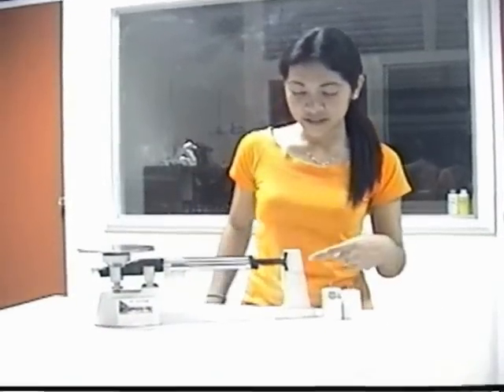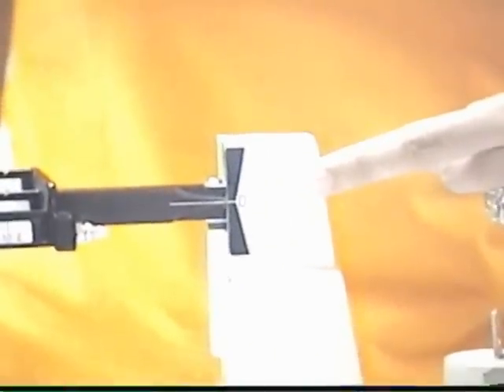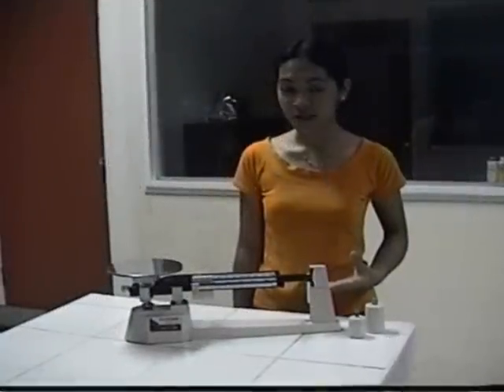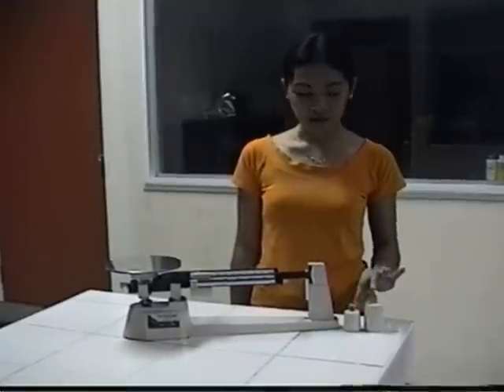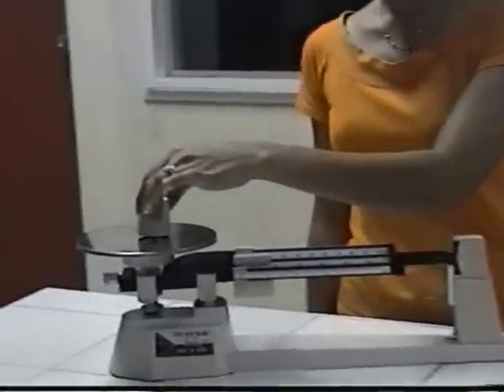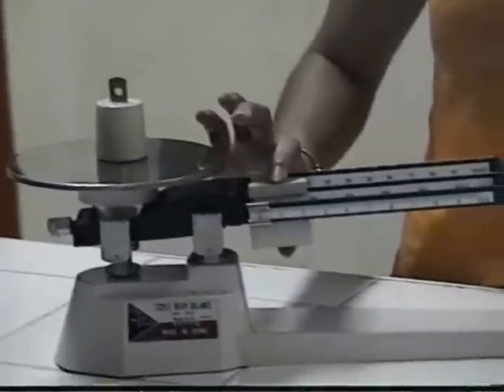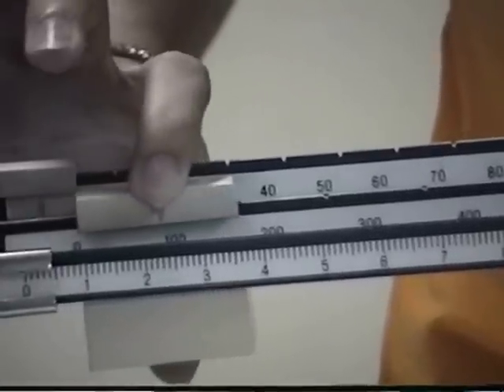By using the Balance, here is now the result of the zero point. After zeroing, it is now time to get the mass of these objects. We place the first object here on the metal platform. Then we are going to move this rider, which is valued by 100. Let's try 100.